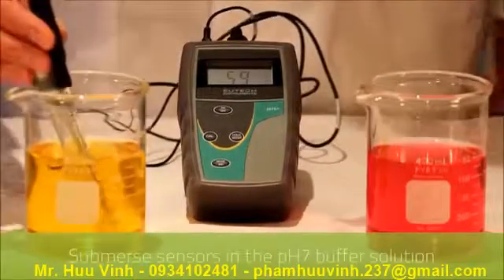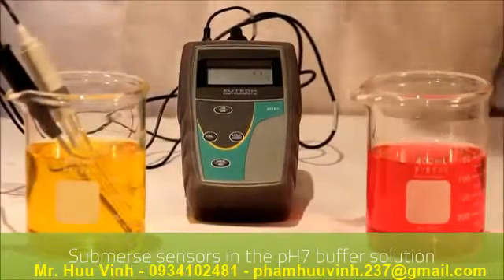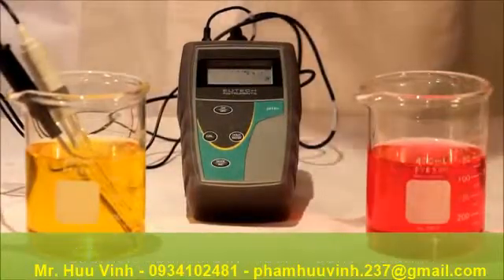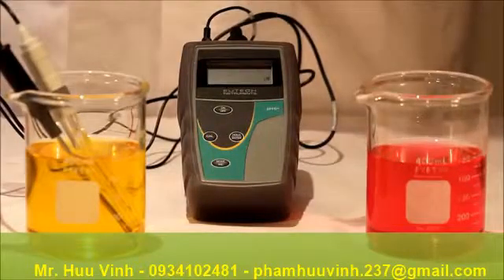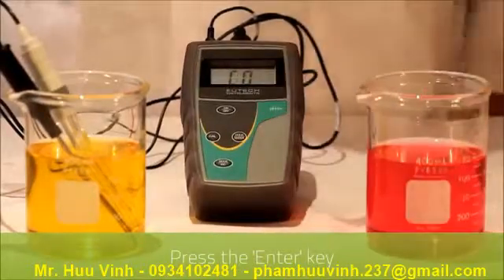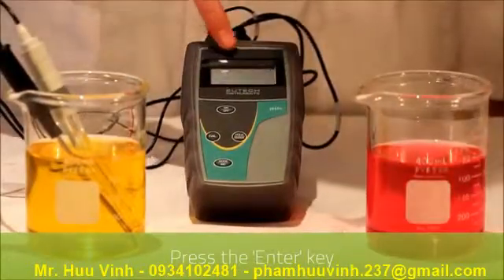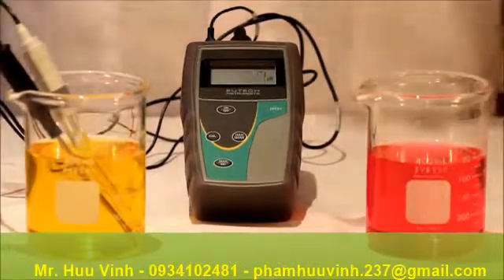We submerse both the temperature and PH sensor into PH buffer 7 and as you can see it has recognized the reading. Once this reading stabilizes we then press the ENTER key. You will recognize that the readout has now adjusted to 7 PH.